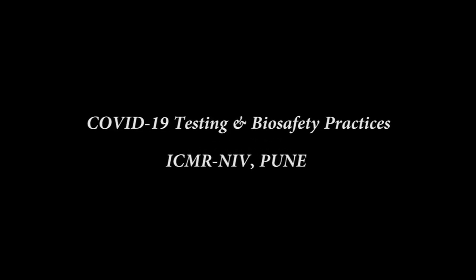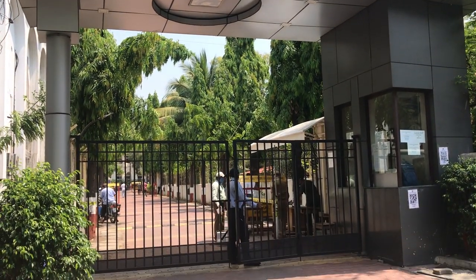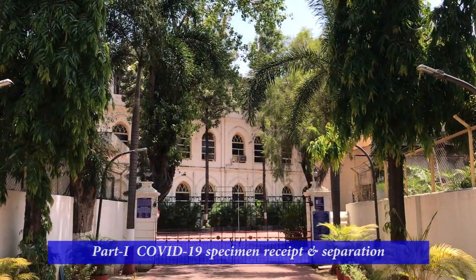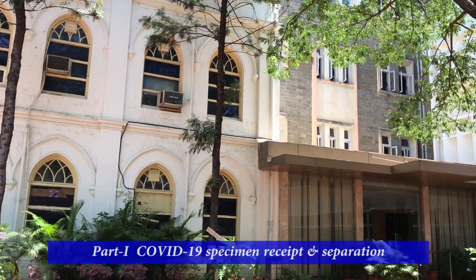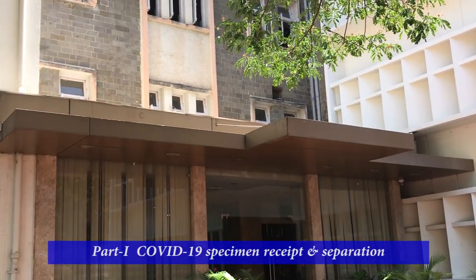This training video shows the biosafety practices and the procedures for the laboratory diagnosis of SARS coronavirus 2. The film is divided into two parts. Part 1, steps for receiving the specimen and its separation. Part 2, extraction of RNA and setting the real-time RT-PCR experiment.